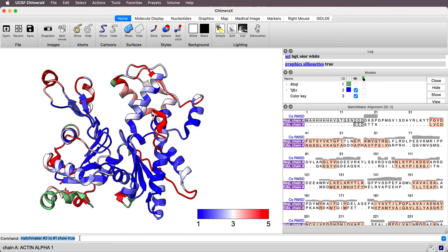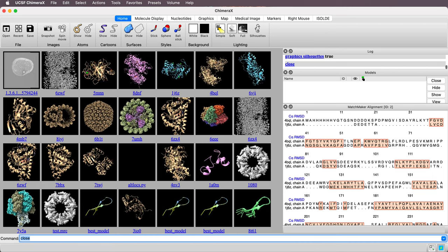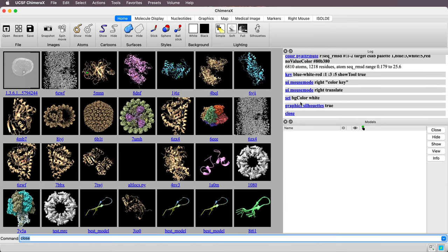Okay, so let me show you the steps to do this. We're going to do this in ChimeraX version 1.6. I'm going to close what I have here and we'll do it from the start.